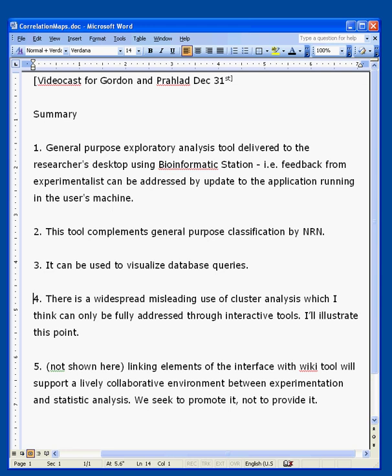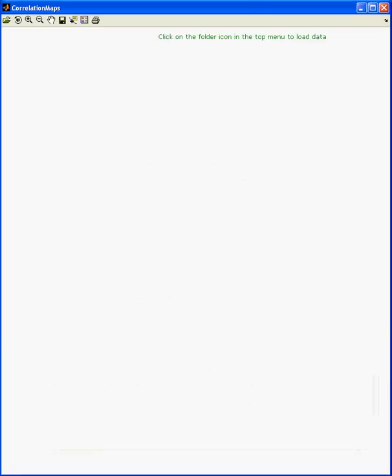Hi, Gordon and Parlat. This is Jonas. About three weeks ago when we met, I promised that before the end of the year I would have a first iteration on a general purpose exploratory tool for the reverse phase protein array data. So here it is. We are a few hours before the end of the year — this is December 31st — and I'm going to try to cover these five minutes while showing you a little bit how this tool works.